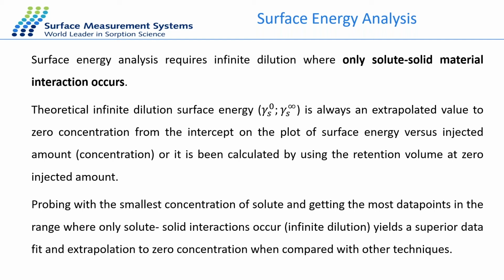And probing with the smallest concentration of solute and getting the most data points in this infinite dilution range, where only solute-solid interactions occur, yields a superior data fit and extrapolation to zero concentration when compared with other techniques where you can't really measure a series of concentrations.